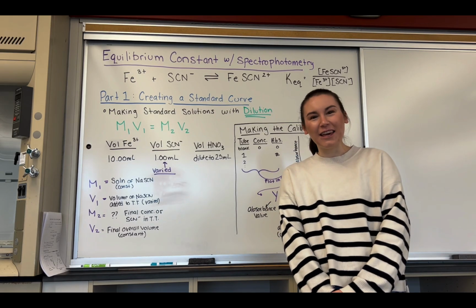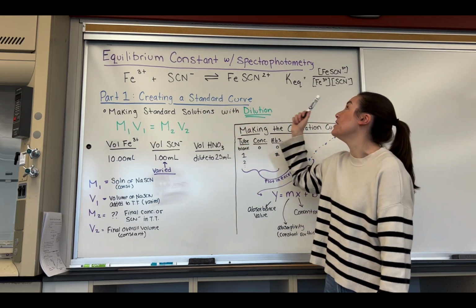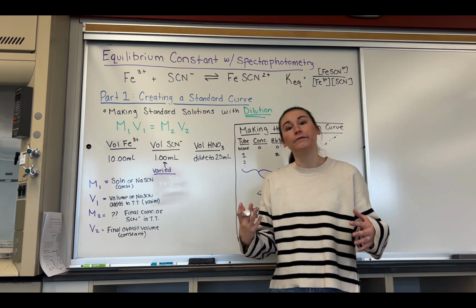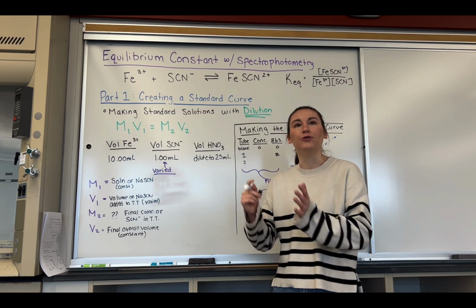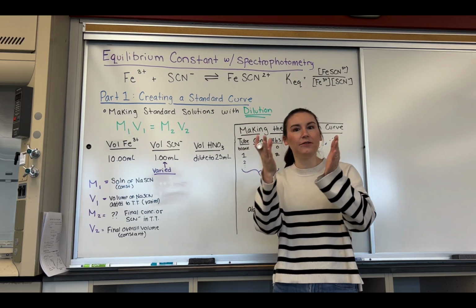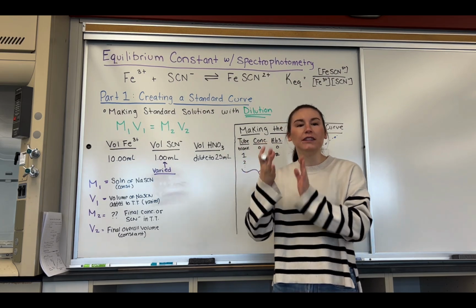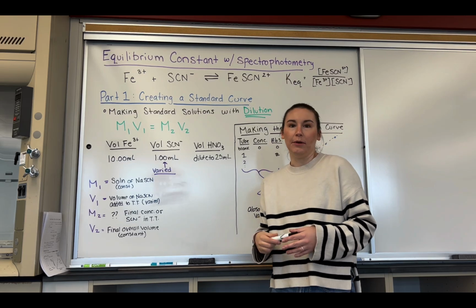Hi everyone, today we are going to be discussing our lab, determining our equilibrium constant with spectrophotometry. This lab has a lot of pieces to it that have to come together in order to get our final result. So the way that I'm going to structure this video is I'm going to lecture and then do our lab, then move on to our next piece of lecture and then do our lab, and then go into more of our calculations portion, just so we can take one step at a time, just like you will in your lab itself.